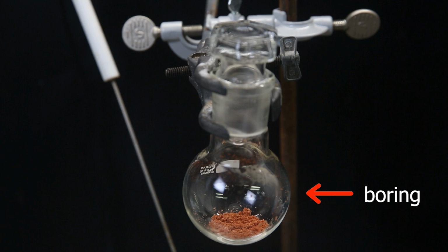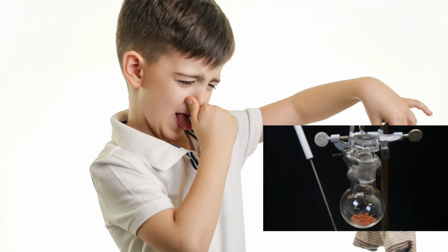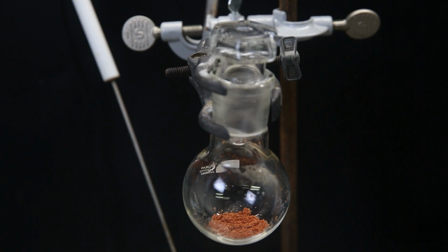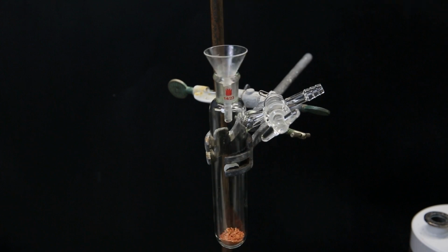Now since the powdered version is a bit boring, I want to make some crystals. The product sublimes easily, and it also has a smell reminiscent of a sweaty locker room and dirty socks. This is actually a handy property, because that means it can be purified through vacuum sublimation. So I set up a Schlenk flask and pour in all of the powder.